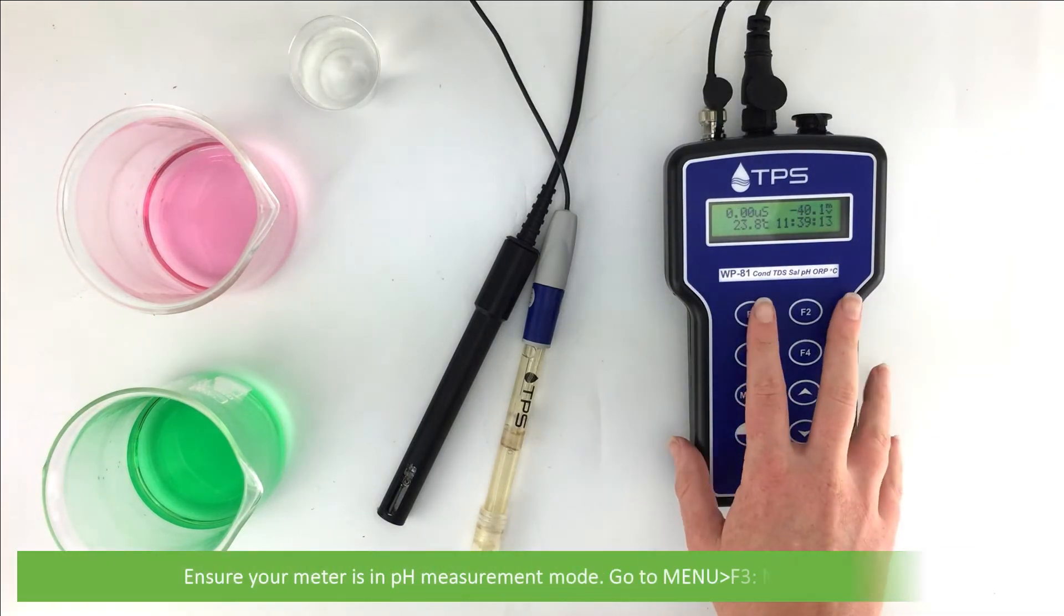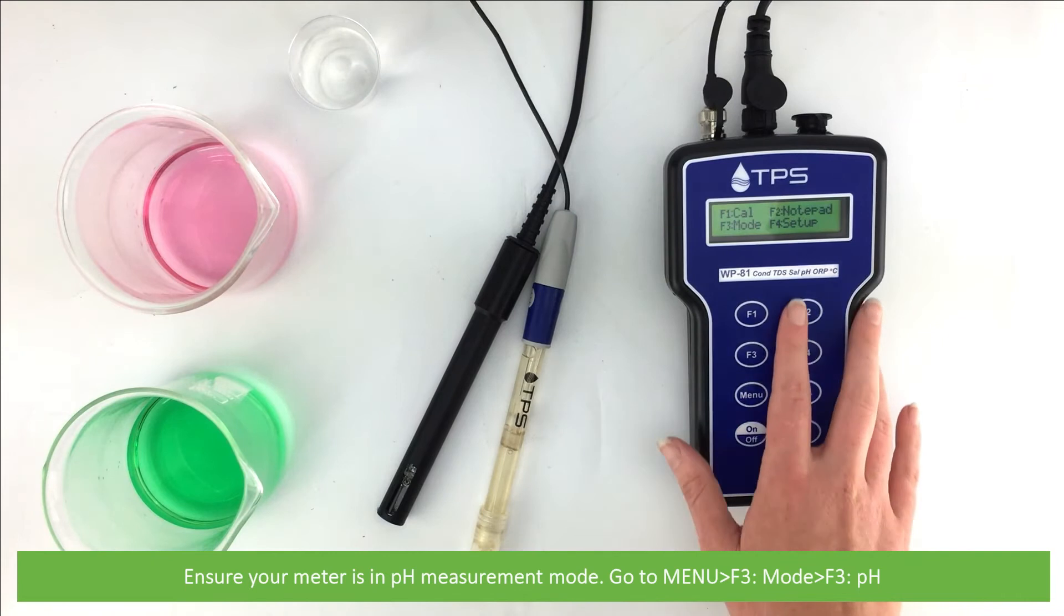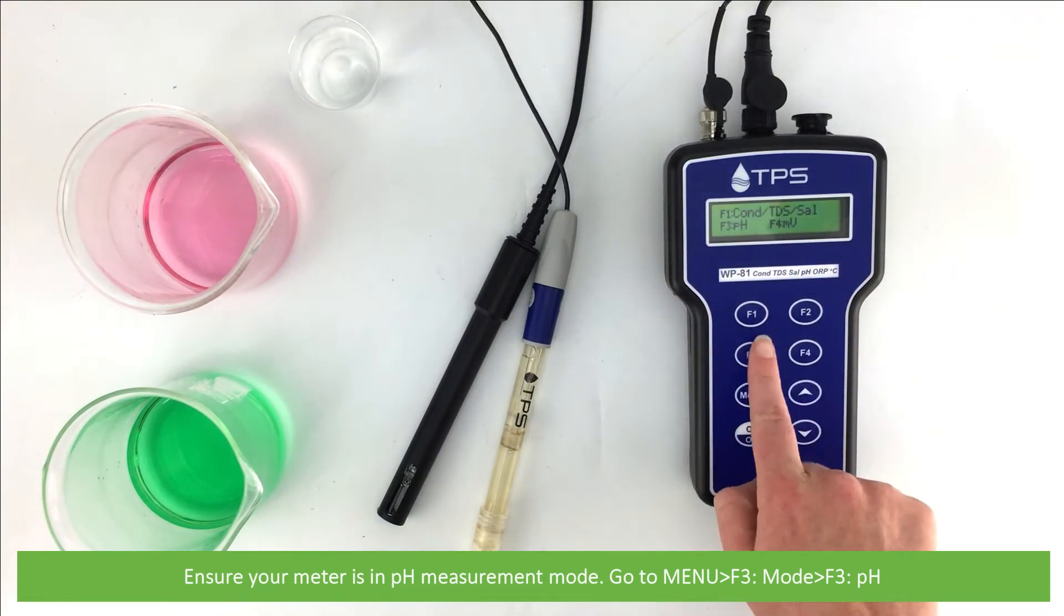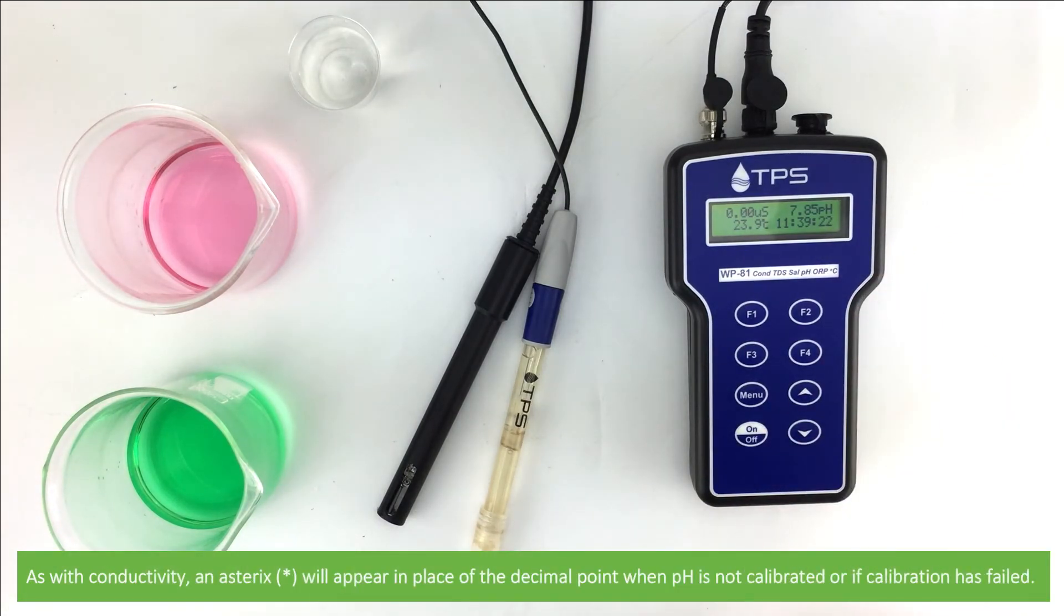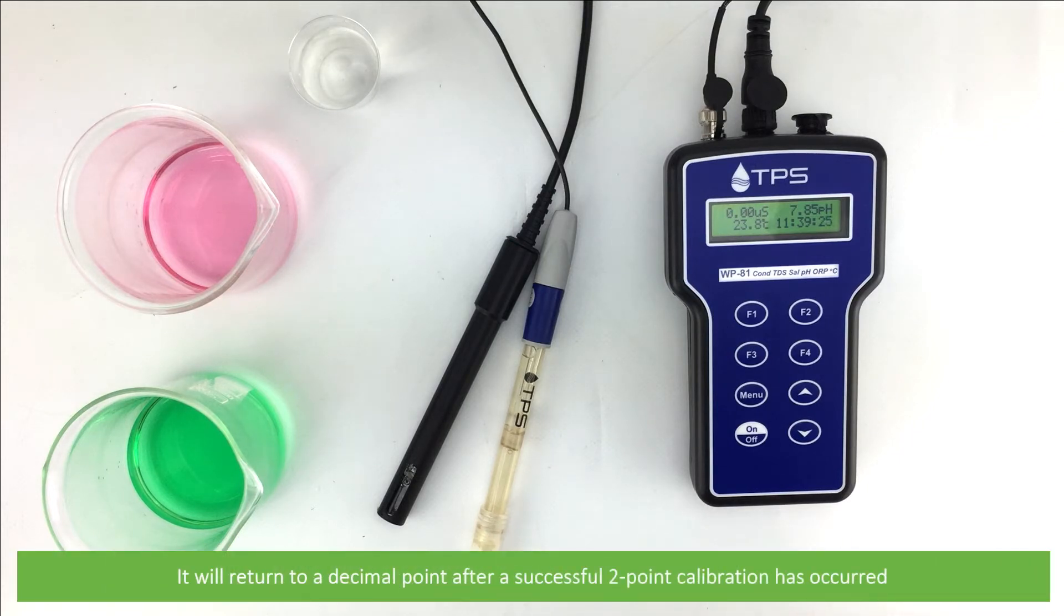Ensure your meter is in pH measurement mode. Go to menu, F3 mode, F3 pH. As with conductivity, an asterisk will appear in place of the decimal point when pH is not calibrated or if calibration has failed. It will return to a decimal point after a successful two-point calibration has occurred.